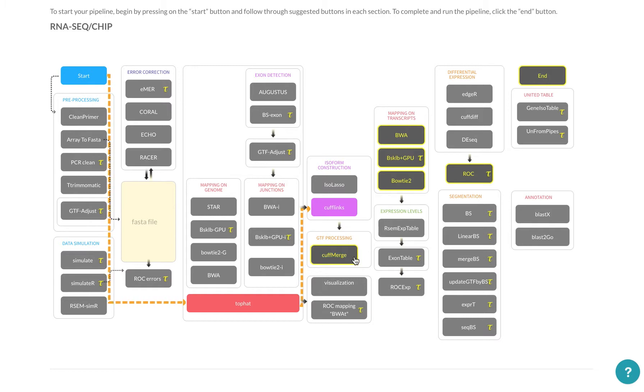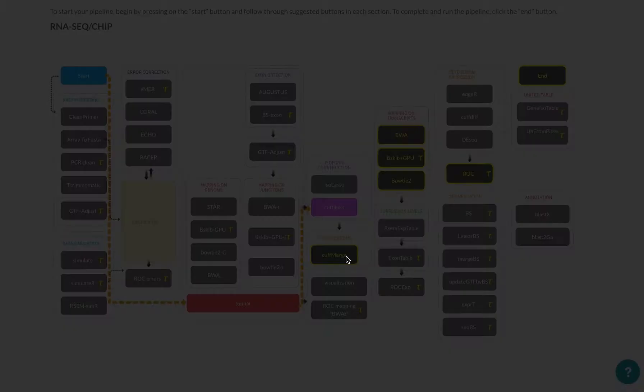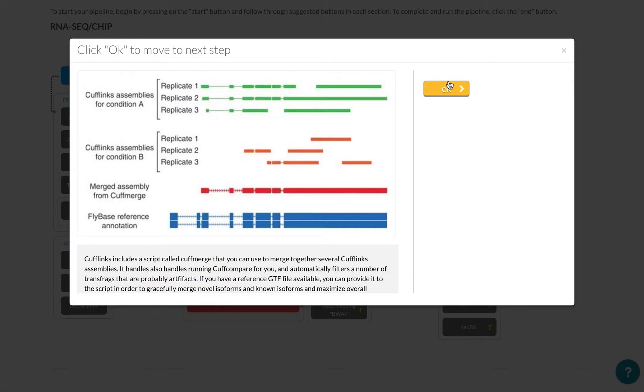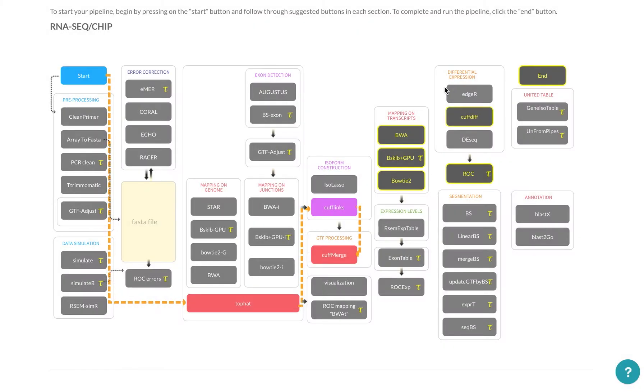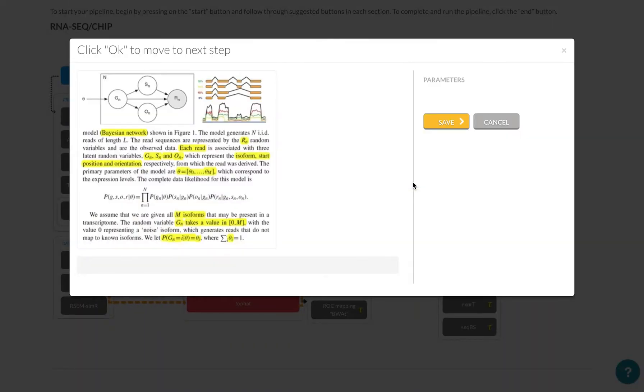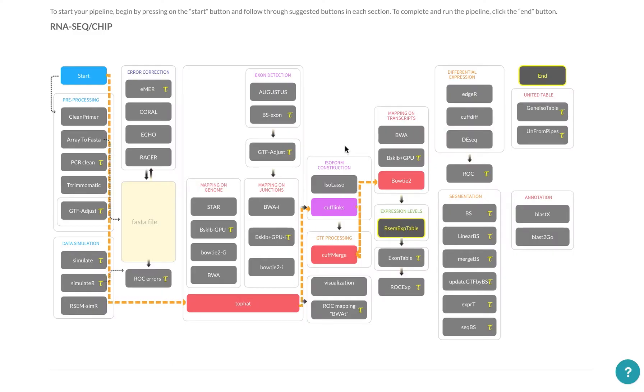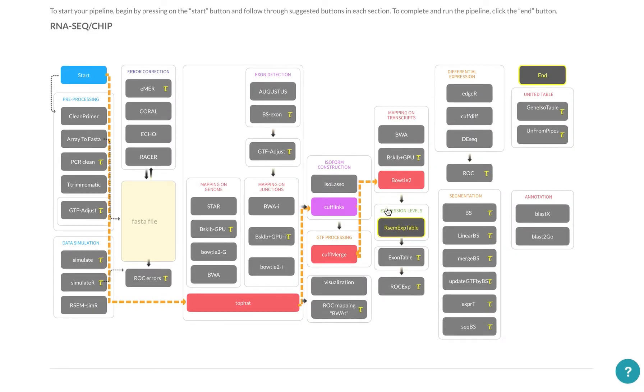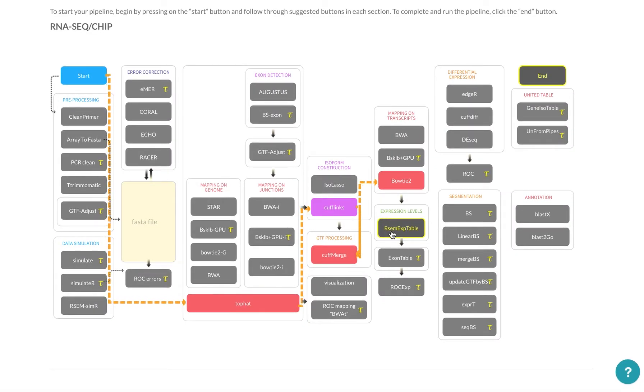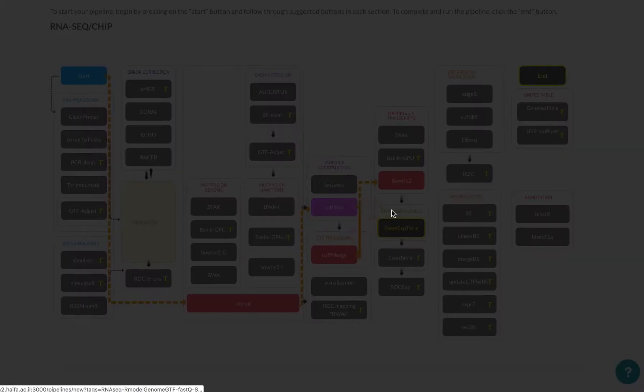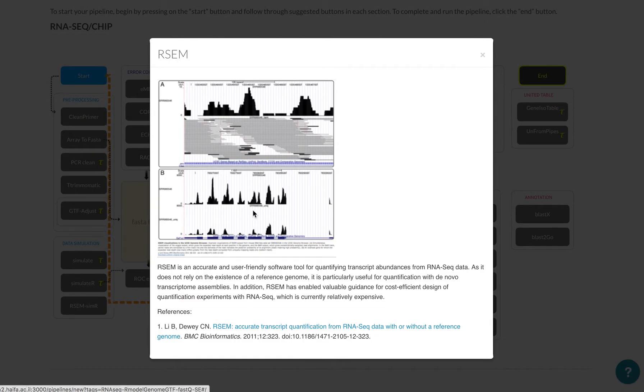I'm going to map it on transcripts using Bowtie2. And then what I want to do is create an expression level table that aligns everything. And you can read, there's a publication over here.